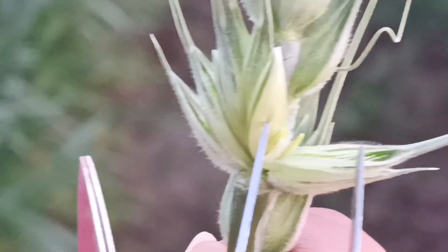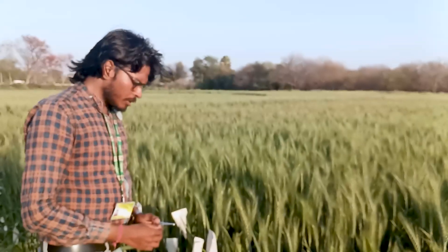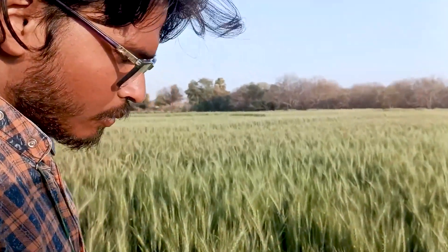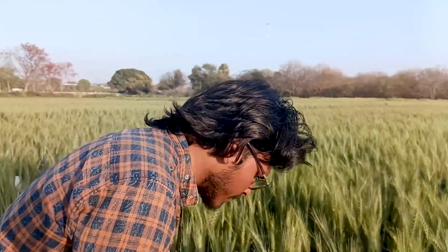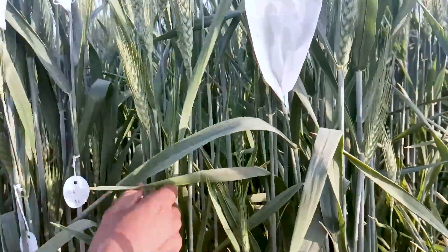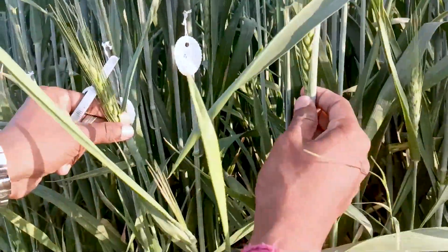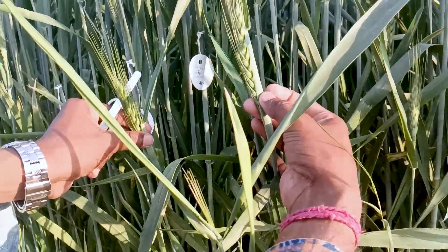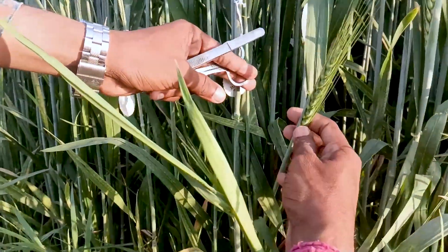Now I will show you how to do emasculation. For emasculation we have to select a spike which is inside the flag leaf — about one third portion. This is a perfect spike, mostly half portion inside the flag leaf, in which we can do emasculation.